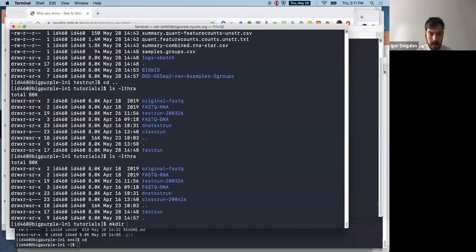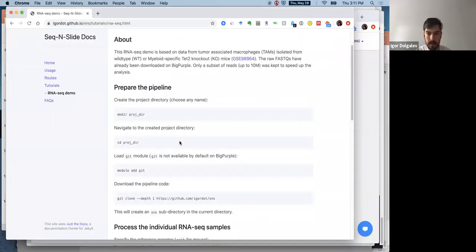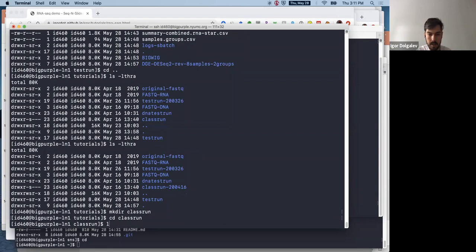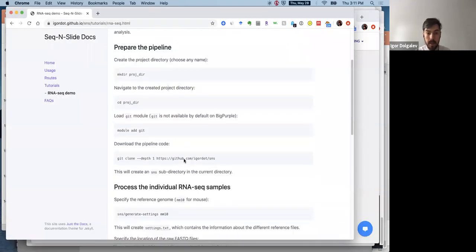We'll make a directory called class run. We'll cd to that directory. Right now, there is nothing in that directory.